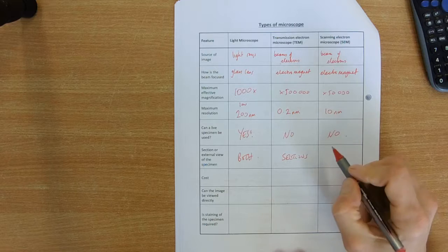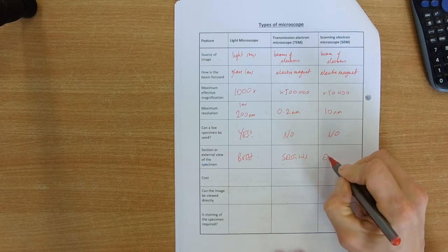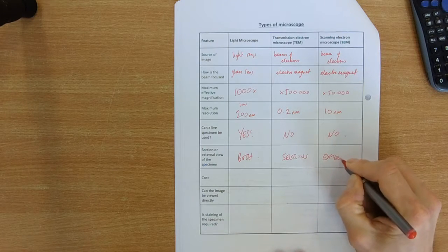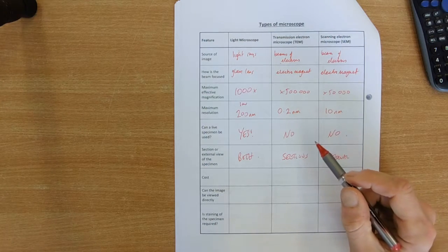And SEM, well, you can see the outsides of things, so it's the external view that you see because it plates the specimen. So external view.